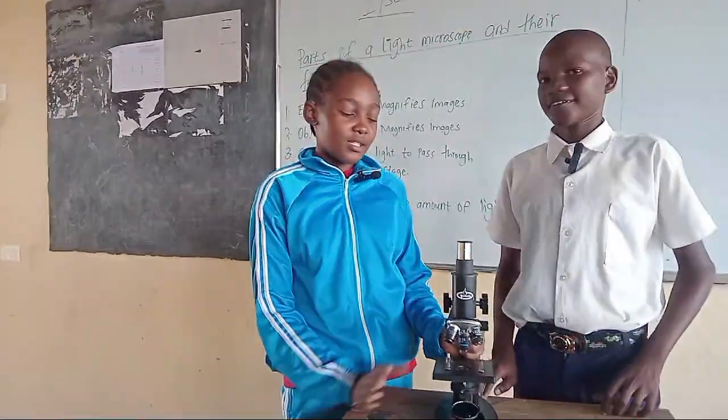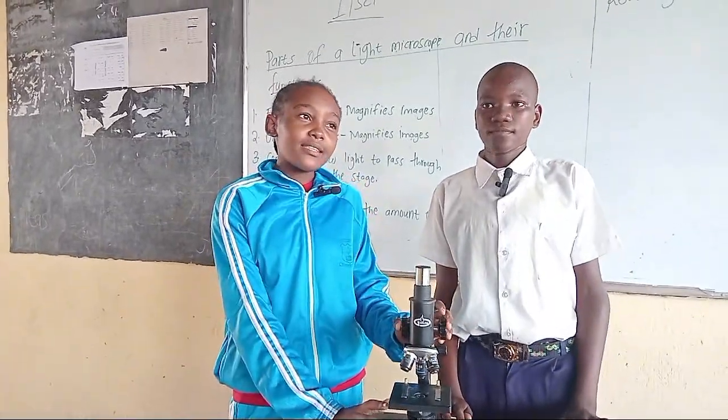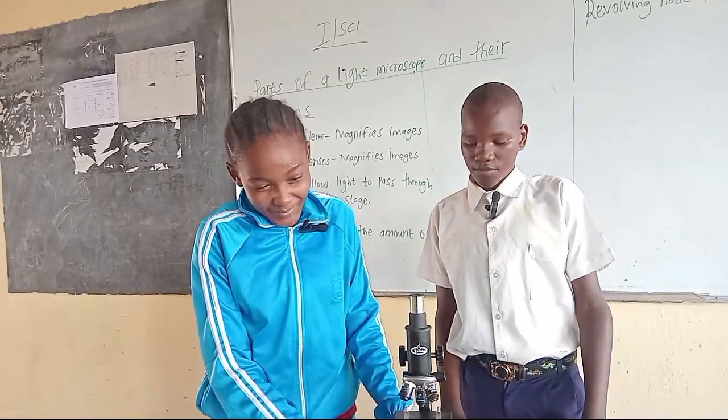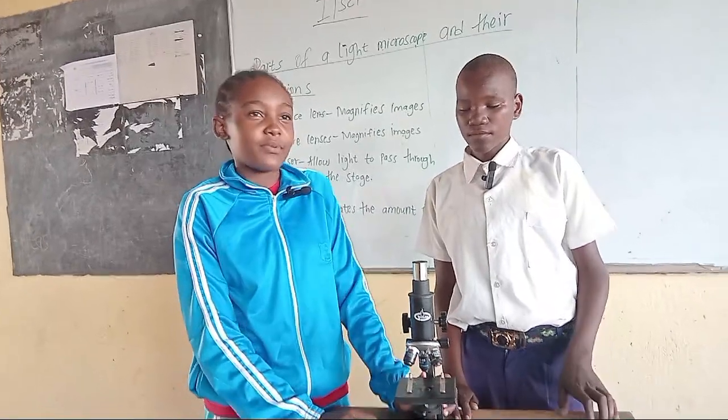And that was all the parts and functions of a microscope. In our next lesson, we will be performing experiments on the microscopes and seeing specimens close up.